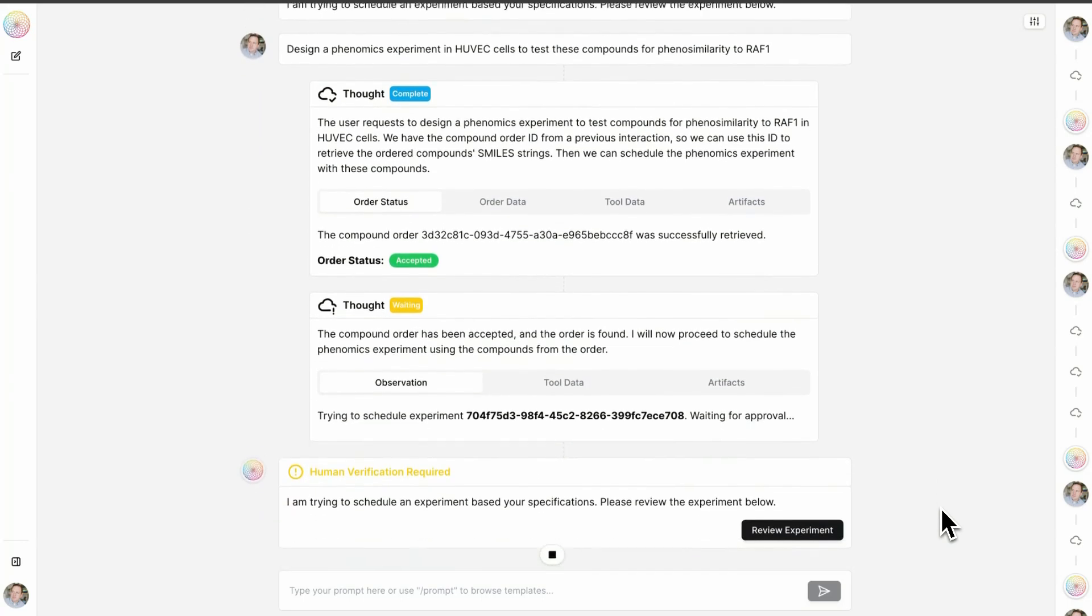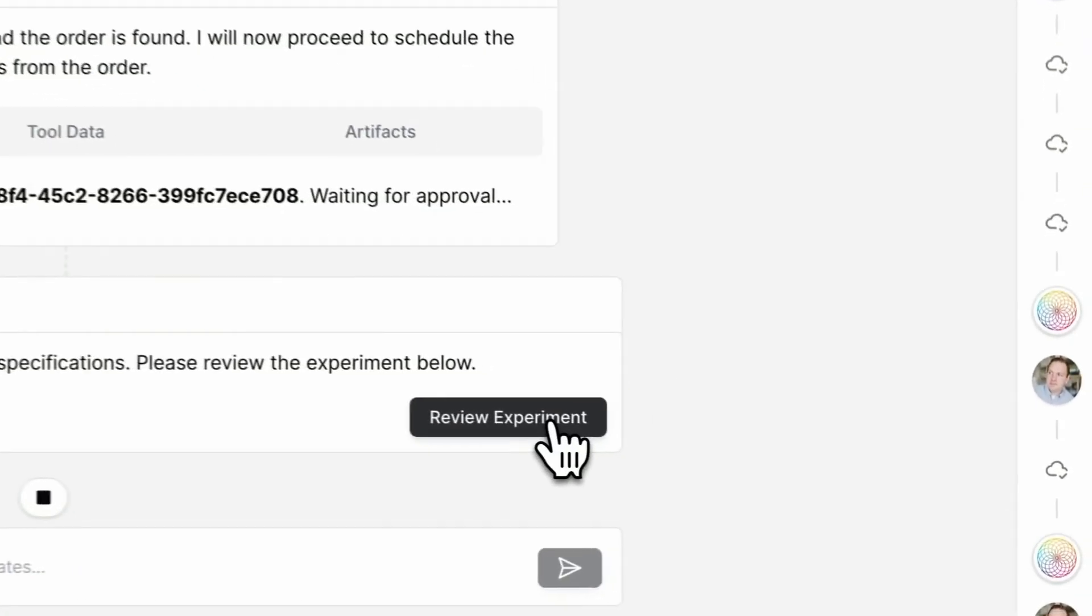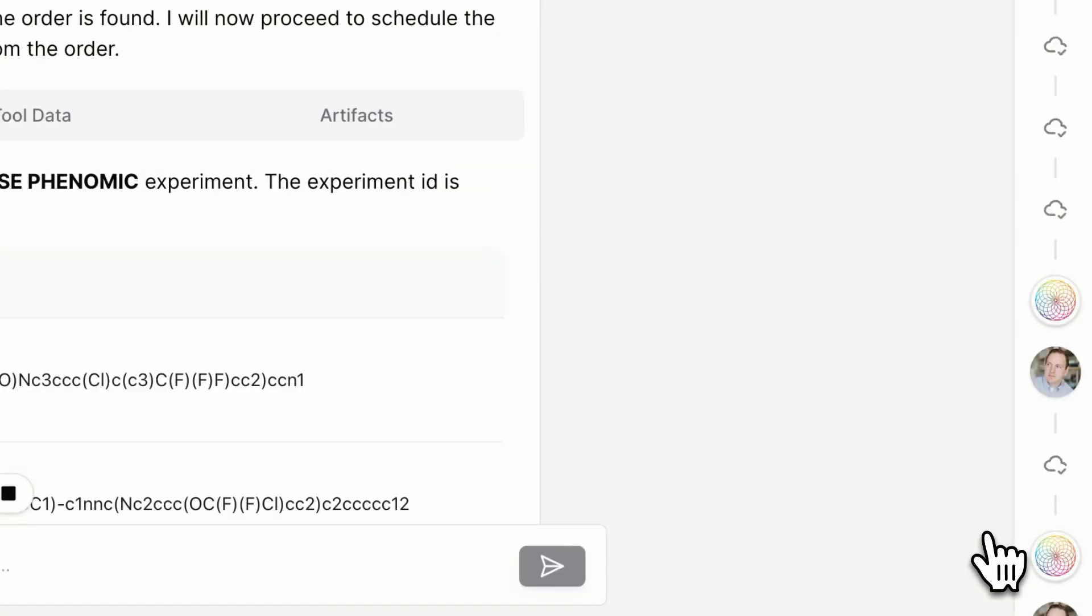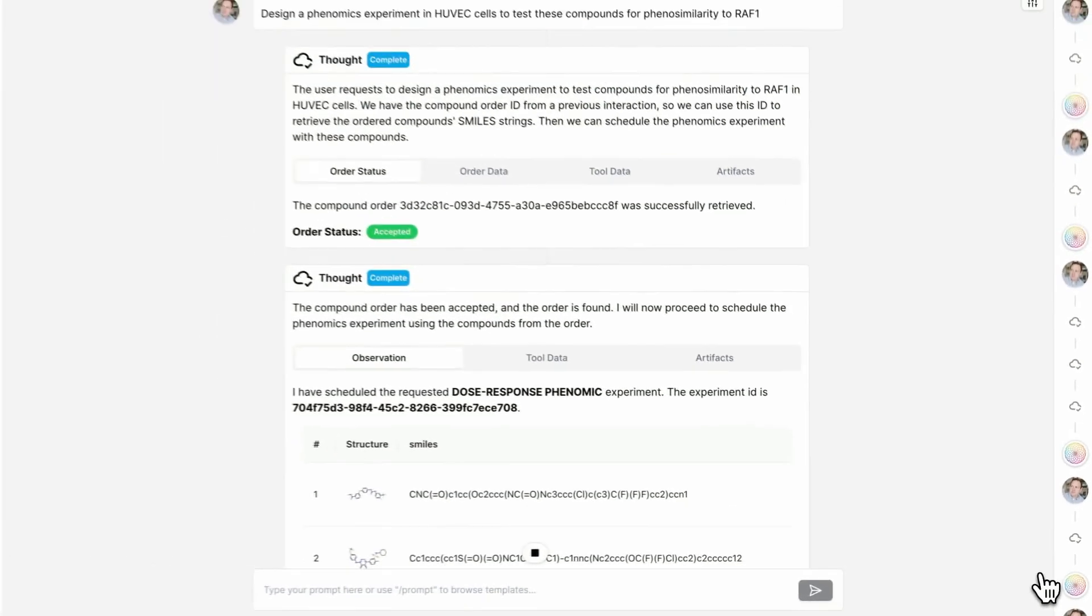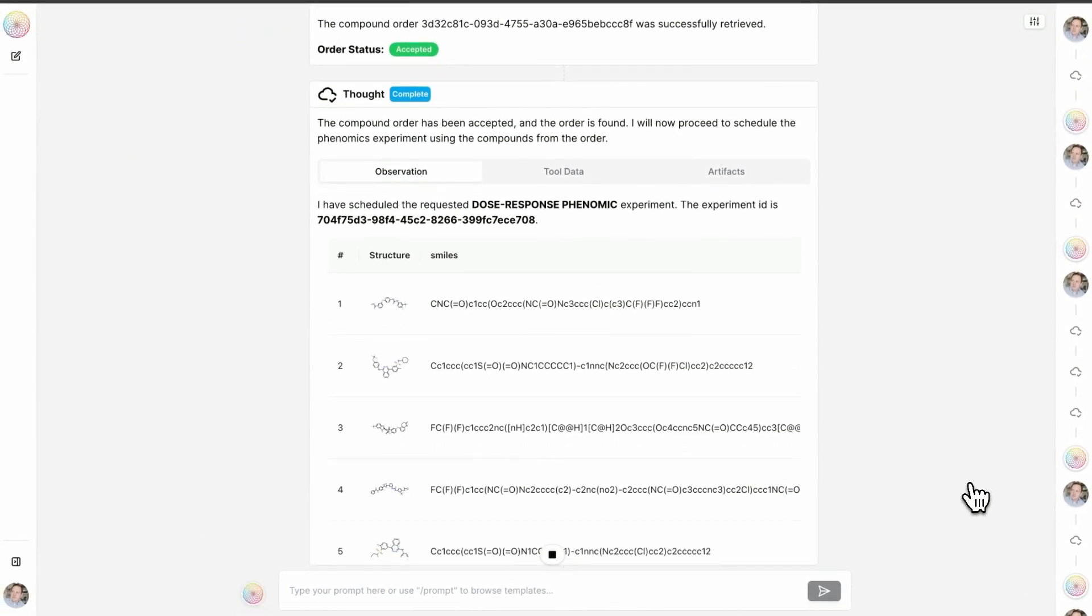You will see here again that we are asking for human approval for this dose response phenomic experiment because we are now interacting with the physical world. I'll accept this experiment and it will be scheduled and then run in dose response where we will be looking at each of these compounds to identify whether or not they, in a dose responsive manner, mimic the CRISPR knockout of RAF1 in primary human endothelial cells.